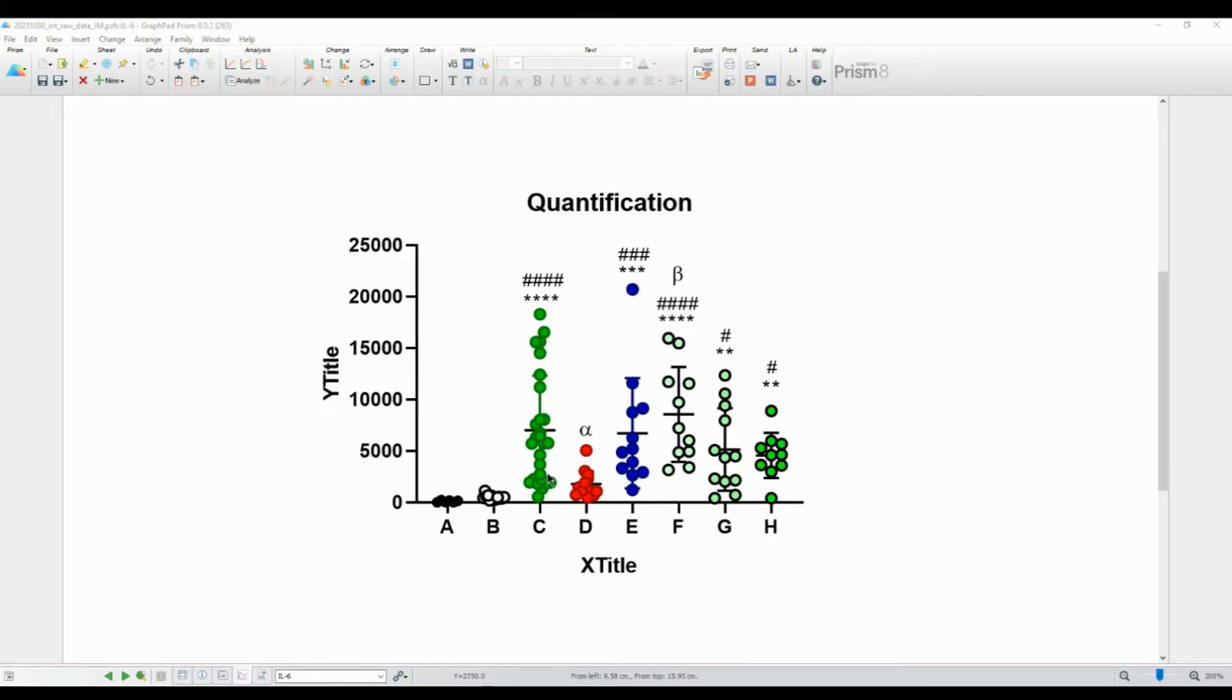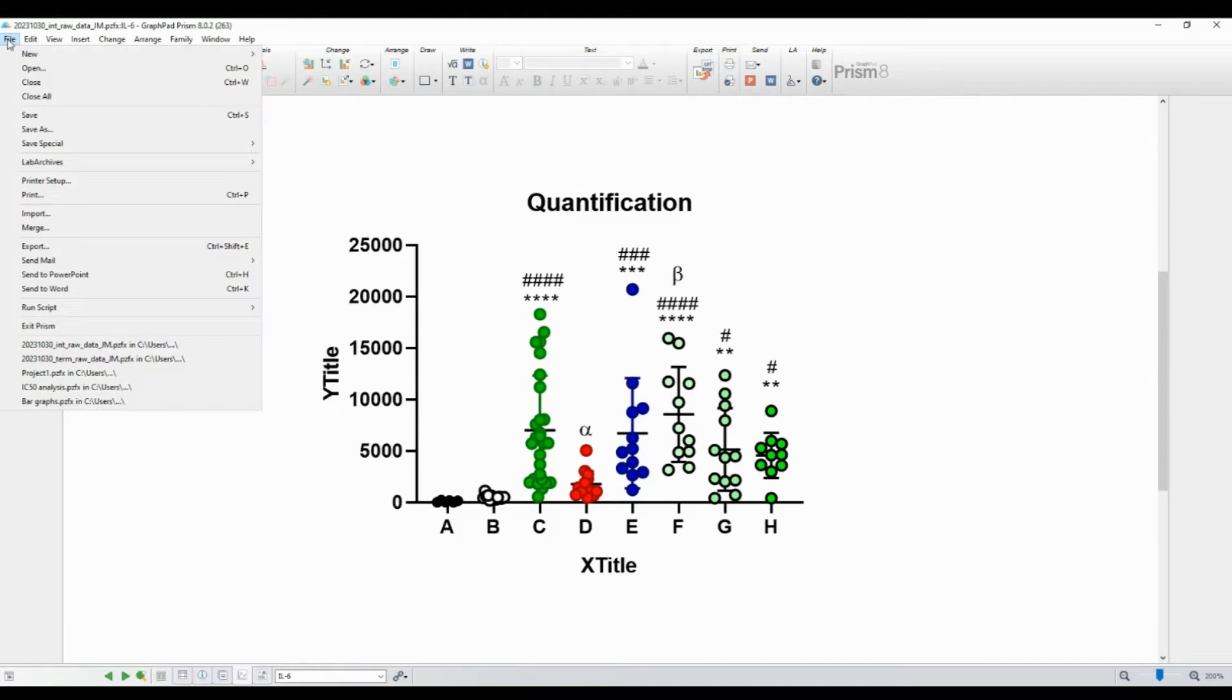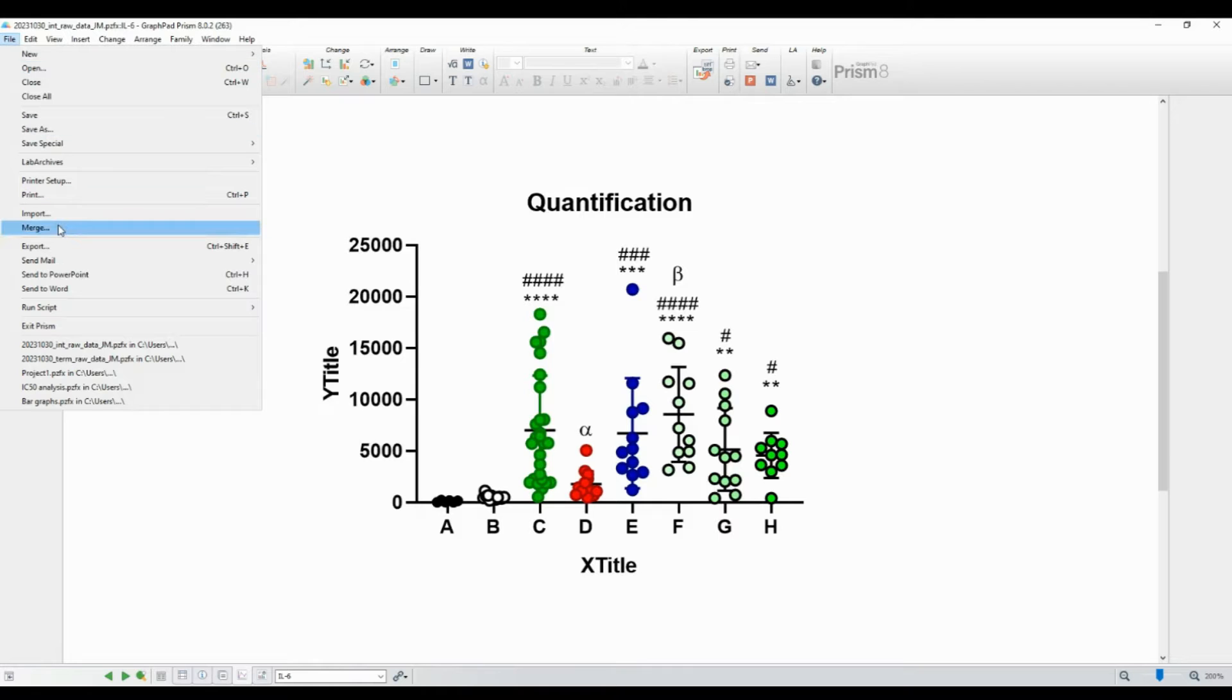First, select the graph that you want to export. You can simply click on the graph to ensure it's active. Next, go to the File menu at the top-left corner of the GraphPad Prism window. In the File menu, scroll down and select Export.